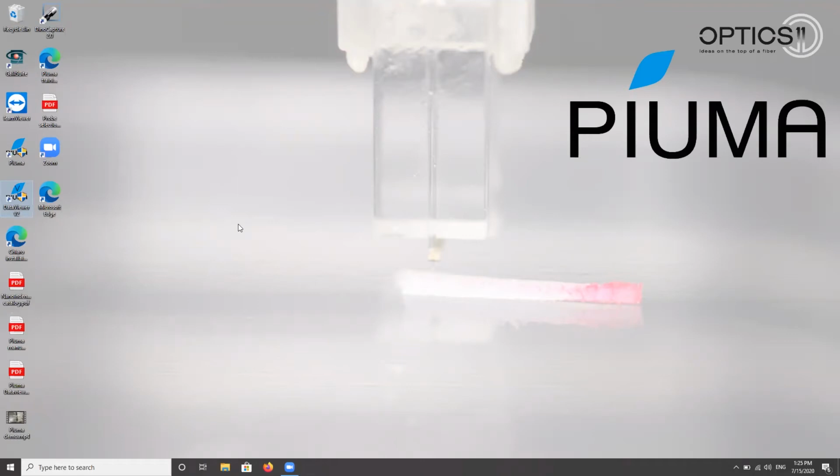Welcome to Nanoindenter training. In this session, we'll be talking about how to analyze your data. So to get started, let's open up the Data Viewer software.